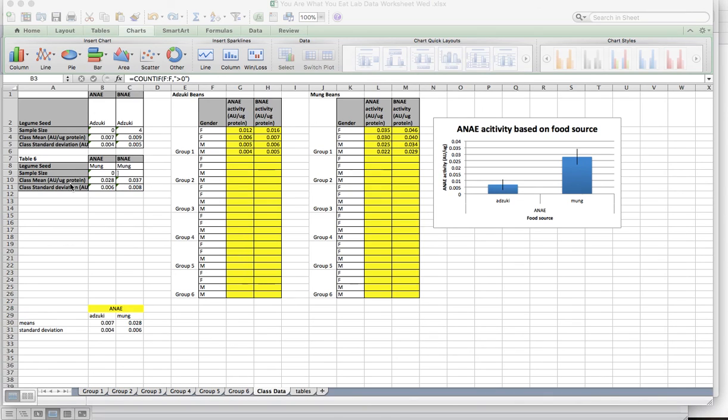I will post a link to a Khan Academy video that will show you how to work with the standard curve a little bit more. It's not going to be with a protein assay. It will be with a solution of a certain compound, but the idea is the same. Once you make a standard curve of known concentrations and known absorbances, you can use that standard curve on anything of that same solution. So with BSA and proteins, if you know the absorbance, you can get the concentration of the unknown. Okay, so I will post that also.